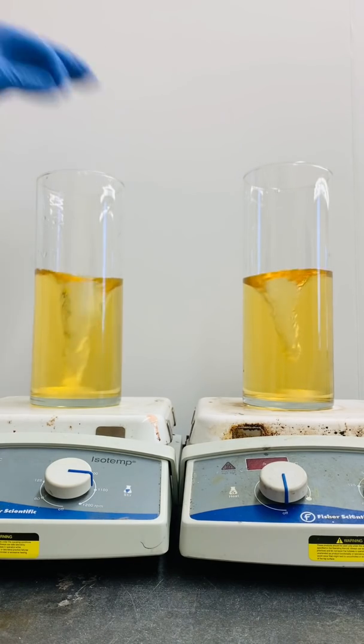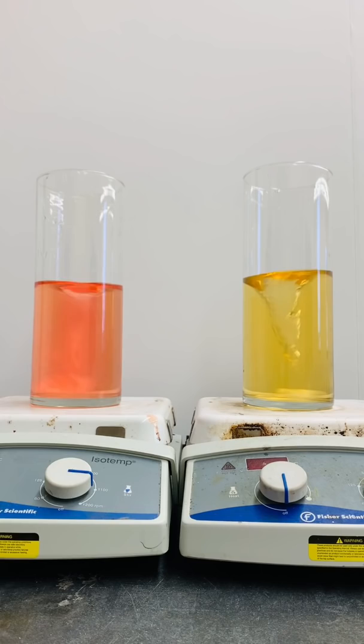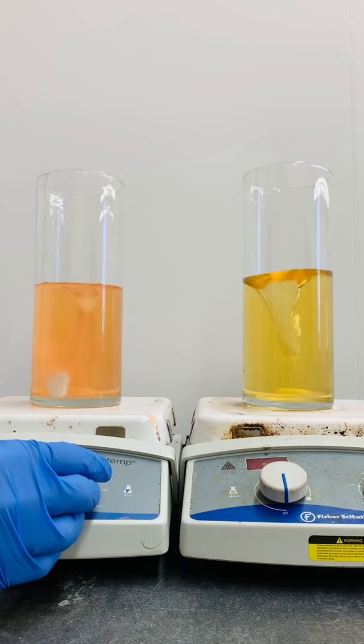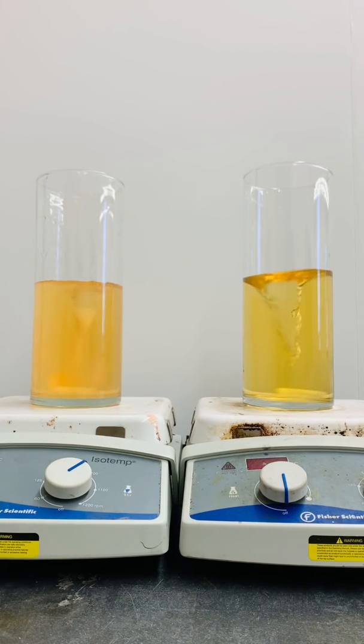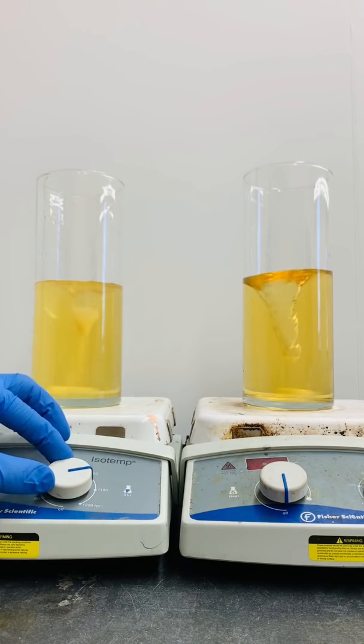Let's add a tablet of Alka-Seltzer to this solution on the left. The initial red color we see tells us that the solution has changed to strongly acidic, but you'll notice it relaxes back to a yellow color, indicating a pH of 6 again.